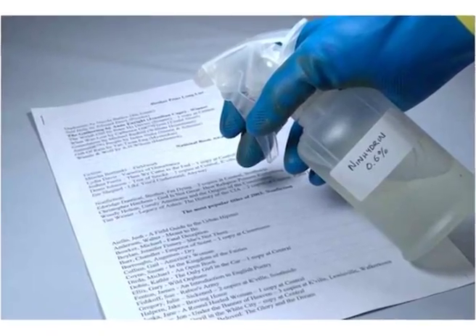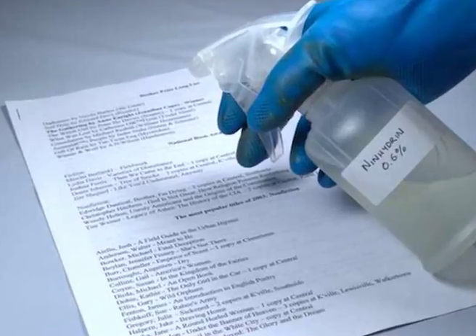Iodine method suffers from few shortcomings. They are that the iodine developed fingerprints fade out in a short time. Hence, these have to be fixed using a suitable reagent. Yet, it is pertinent to state here that other fingerprint detecting techniques such as powder dusting, ninhydrin spraying and cyanoacrylate fuming do give good results only after post-treatment operations. Iodine is toxic and poses occupational hazards to the user. Nevertheless, by observing some simple safety precautions, this problem may be eliminated.